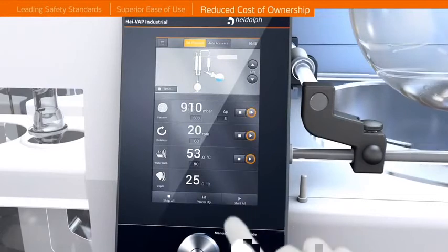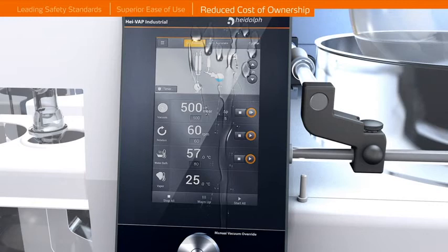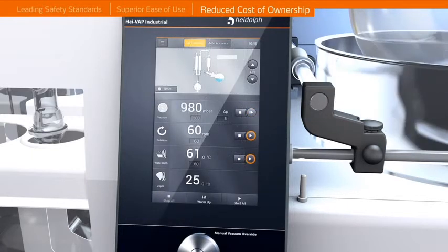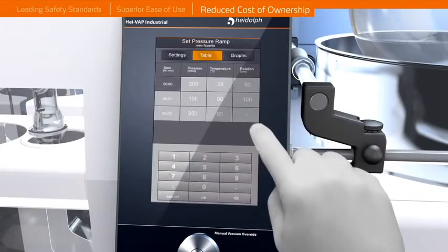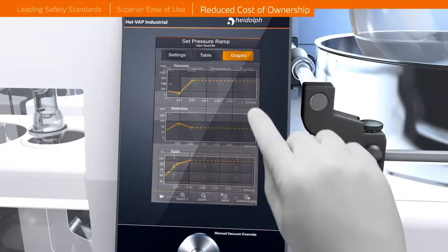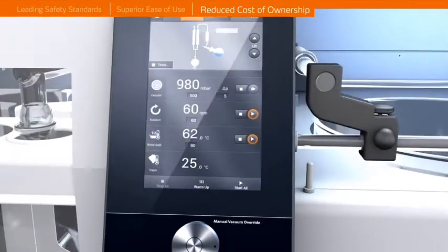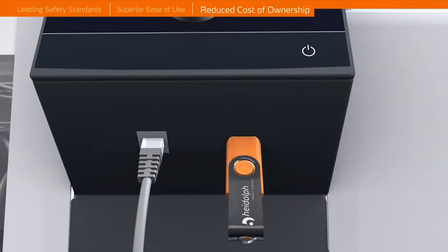Reduced Cost of Ownership. A touch screen panel provides intuitive operation while the glass layer on the panel protects the internal electronics against liquids and corrosion. The unique user interface offers a number of intuitive features like a preheating option for the heating bath to ensure an efficient workflow. Productivity increases can be achieved by utilizing some of the integrated automatic distillation programs and ramping functions. Instant software updates and process documentation are enabled through USB and LAN interfaces.